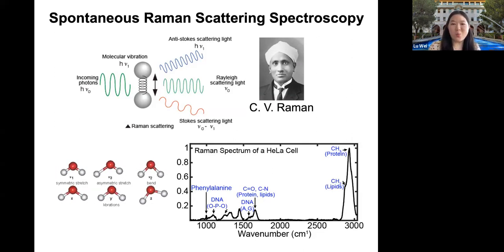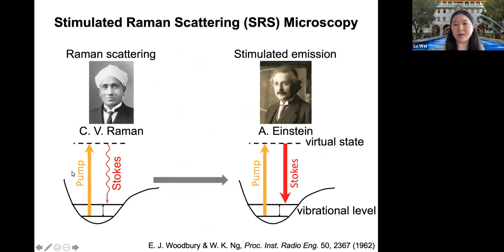But you may wonder why Raman is not so popular for bioimaging yet. Well, it's getting more popular. It's because compared to the highly sensitive fluorescence, Raman scattering is a quite weak process. So for a long time, its sensitivity has been limited to a very high threshold. It's not very applicable for low concentration analysis in biological samples. To address this limitation, stimulated Raman scattering, we call it SRS, has been proven to be a more applicable and ideal strategy for biomedical microscopy of cells and tissues.